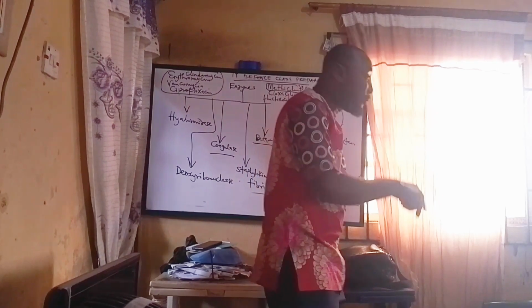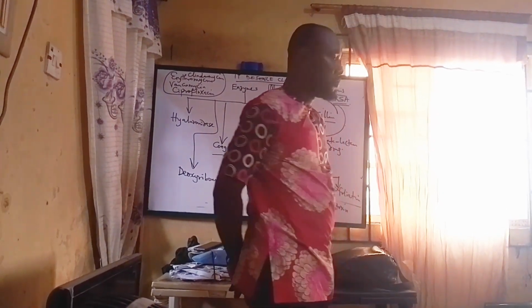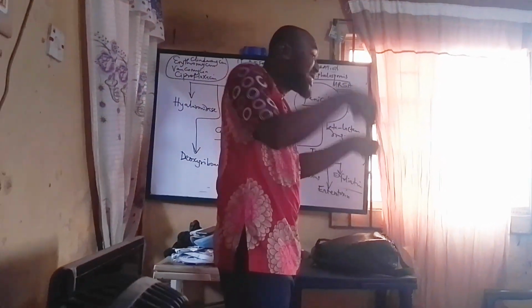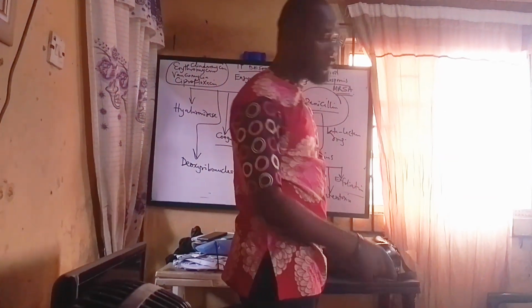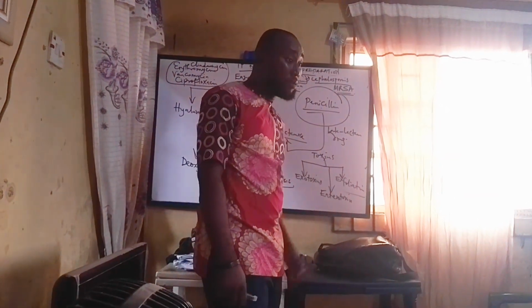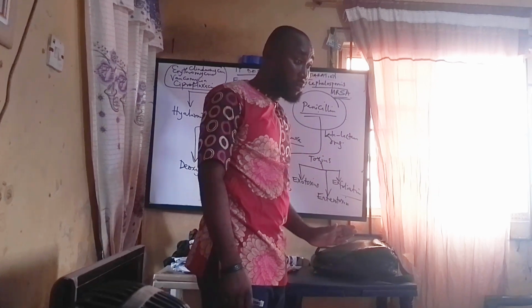Now the question is, that staph, do you know the species? No. You will now do coagulase test. It is coagulase that will now prove that it is staph aureus. Are you getting it now? That's the way you are going to present it.